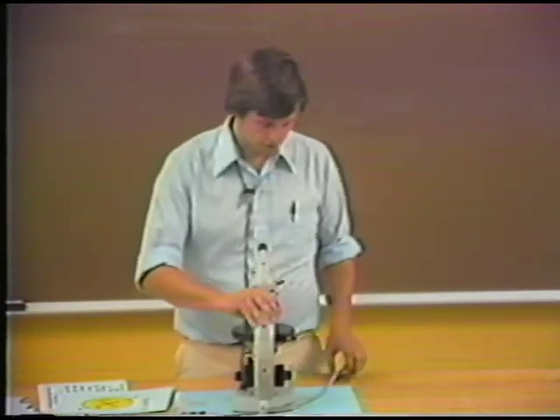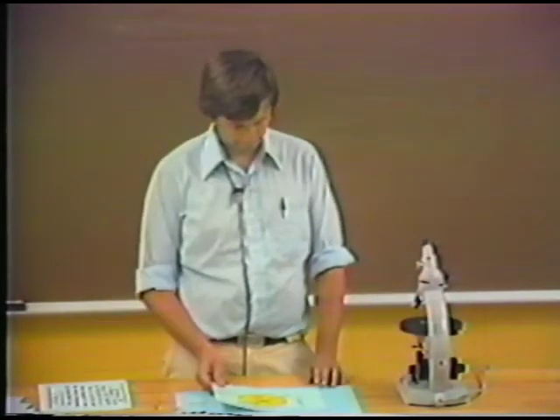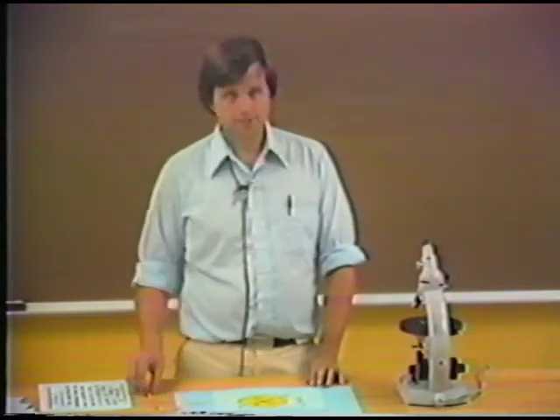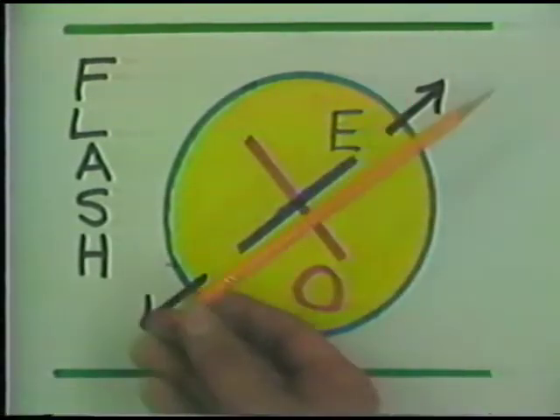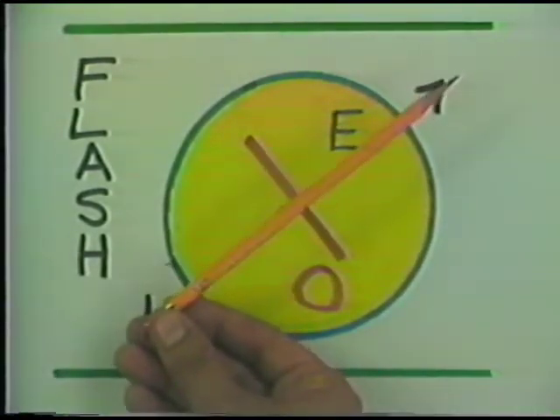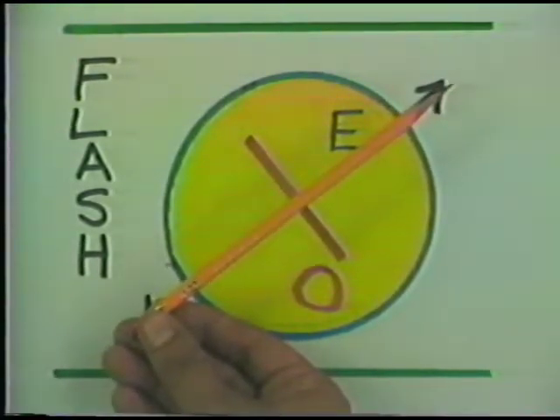Now once you find the grains that show the flash figure, the procedure is to look at the figure and do the rotation of the figure and watch the position in which the isogyres leave the field. The position in which the isogyres leave the field effectively locates the extraordinary ray. And that's an important kind of orientation. This is the only figure where you can look at the E ray by itself and measure epsilon by itself.